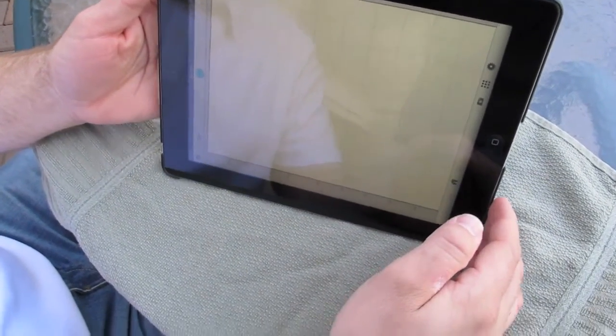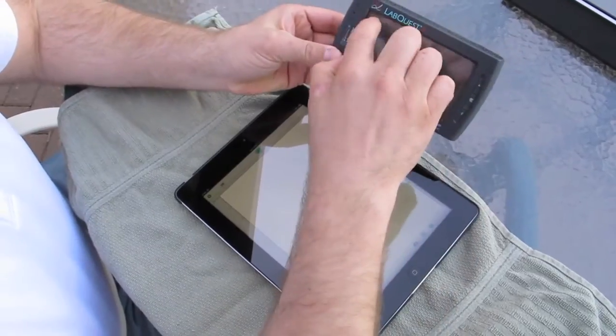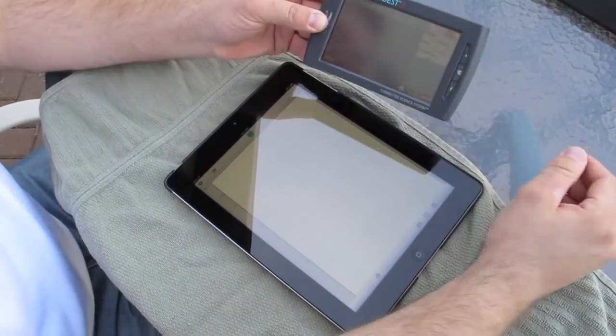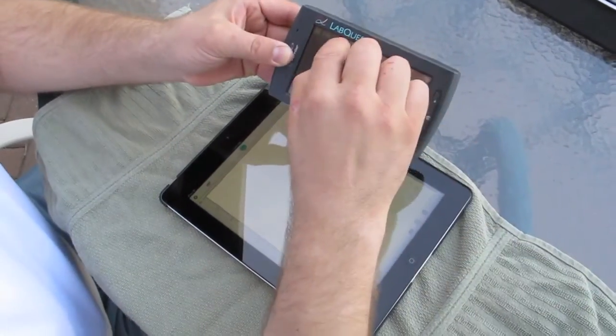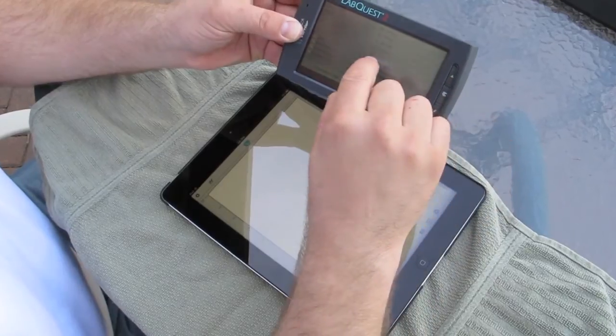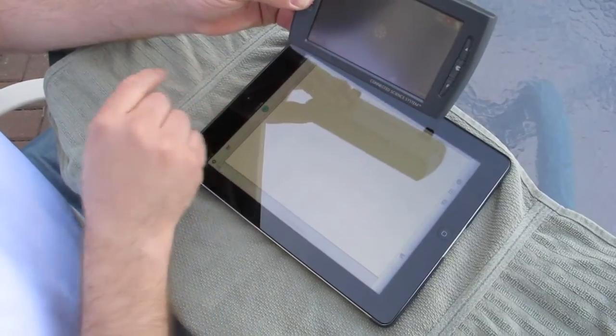Turn the microphone on. How do you turn the microphone on? Well, let's do that. I'm going to have the app here, and I'm going to go back to the LabQuest app. Does the app control it or just report out data? I don't have it set up that way, but you can. So I'm going to go to Sensors, Sensor Setup, and choose the microphone. Then we can listen to ourselves. Well, here you go, but obviously it's not collecting, so I'm going to hit play, and there's the data.